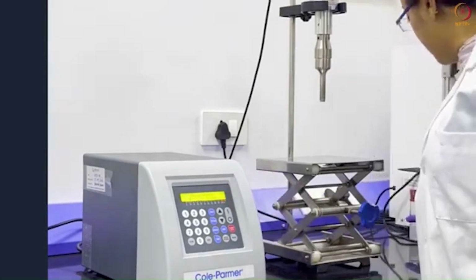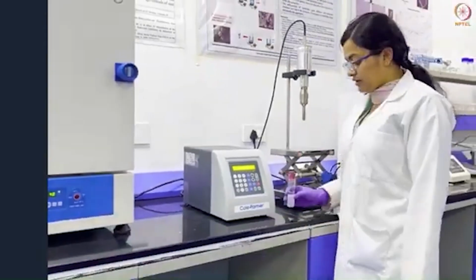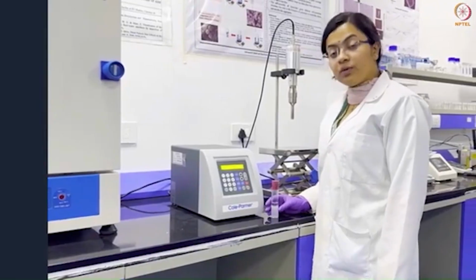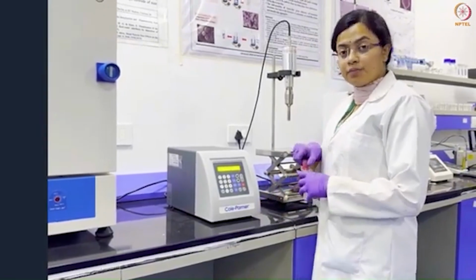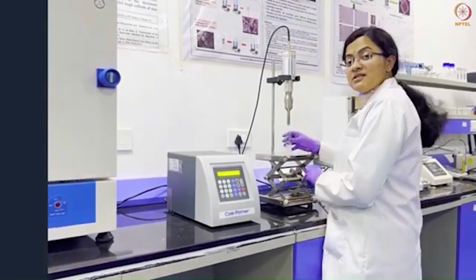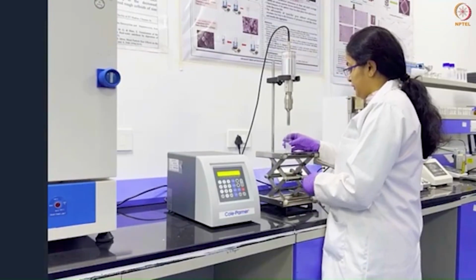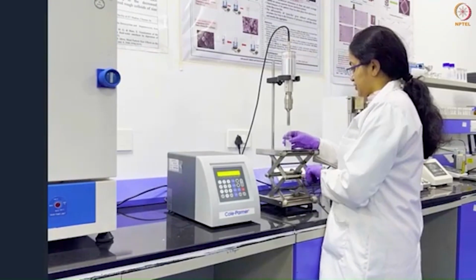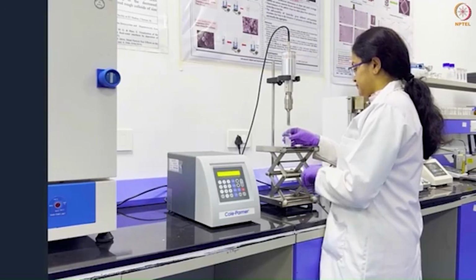Now we will shift to our system. This is an oil and water solution. We will set it up for probe sonication. We place this in our sample holder and we set this up for sonication.